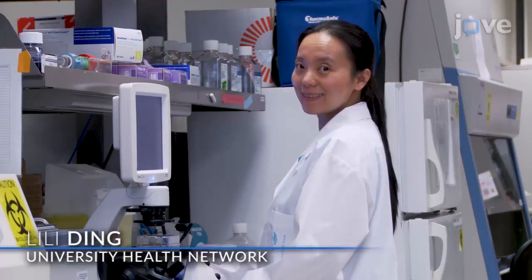Visual demonstration of this technique is important as it helps to demonstrate the surgical steps involved in model establishment. Demonstrating the procedure with Harley Chan and I will be Lili Jing, a technician from our laboratory.